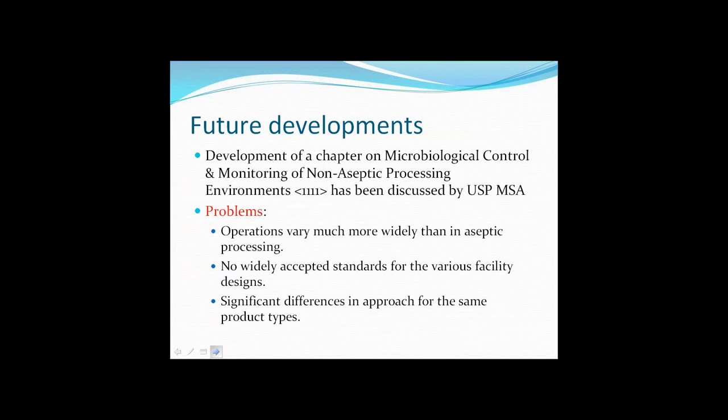I think the difficulties here are that the risks for non-steriles vary perhaps much more widely than we'd find in aseptic processing. There aren't very clear standards in relation to facility design, and there are a lot of differences between different manufacturers.